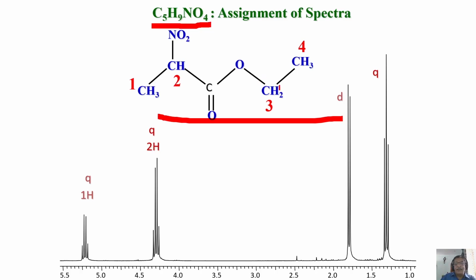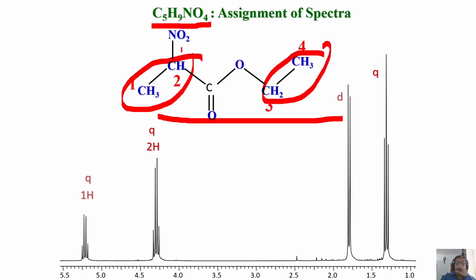Look at it. This CH2 and CH3 are coupled, and there is a breakage here. You know, long range coupling is not seen. If you see 1, 2, 3, 4, 5 bonds away, these couplings are not generally seen. So this forms one coupled spin system, and this forms another coupled spin system. So you have to analyze only two coupled spin systems. That's all. No coupling between them.